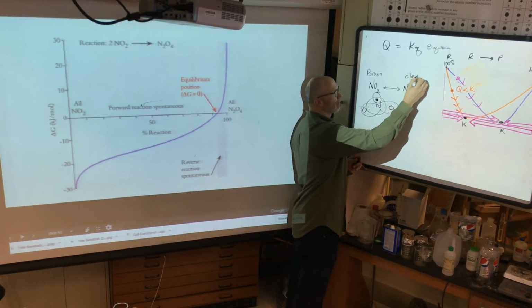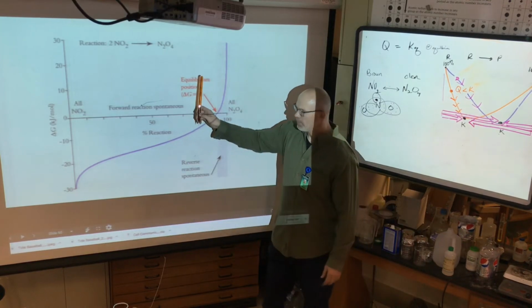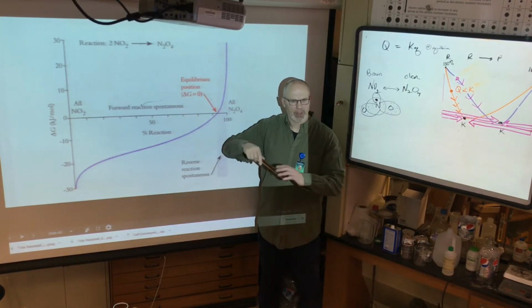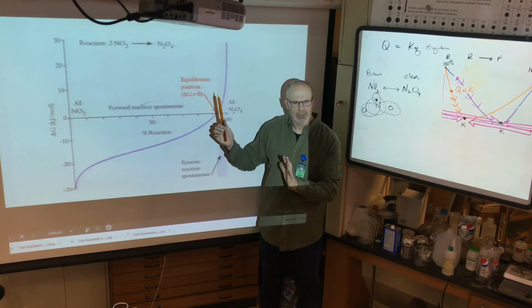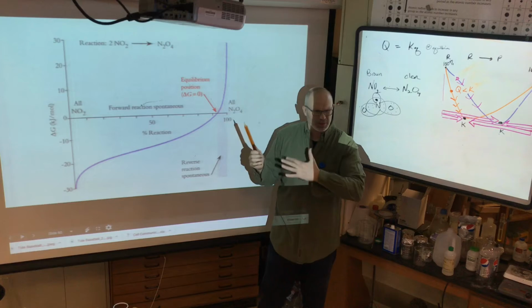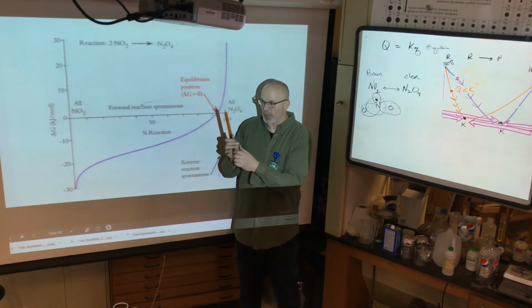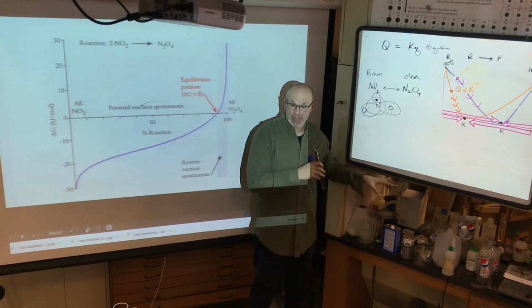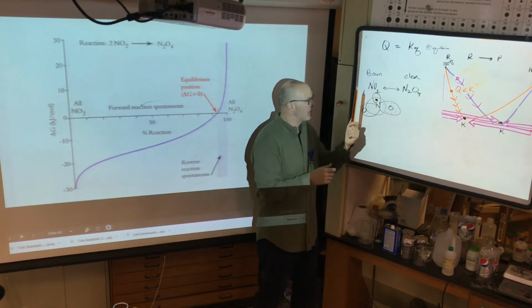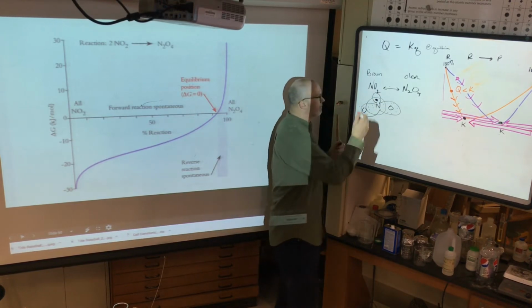So are we in equilibrium? Of course we are. Okay, I'm telling you. Now you see, Mr. Grass, this is a colored glass. No, it's not colored. It is not colored. You see more brown than clear, but clear you don't. So it's hard to compete with clear, right? Any little brown will compete for the clear. By the way, this was the gas that came off of nitric acid. Remember nitric acid? We did it with copper. This was the NO2 gas, but it's in equilibrium. And by the way, I have this wrong. I need 2 of these, right?